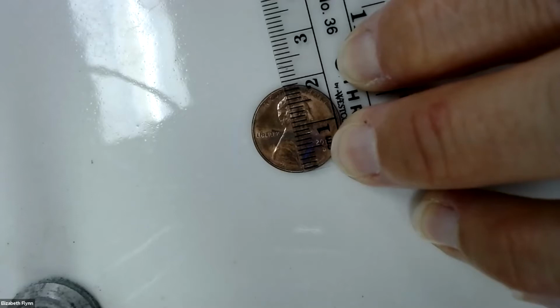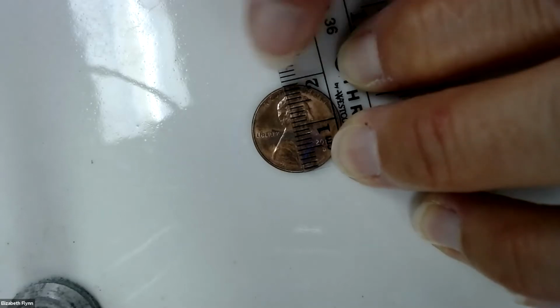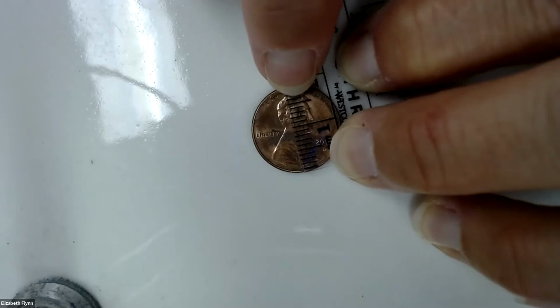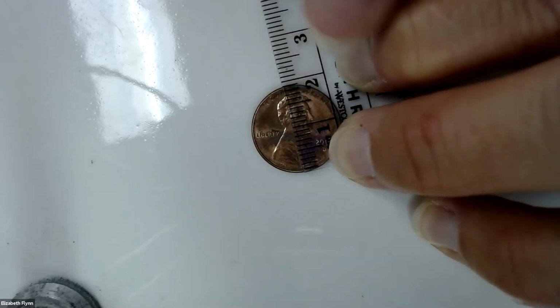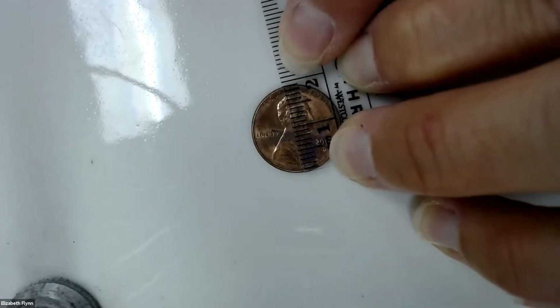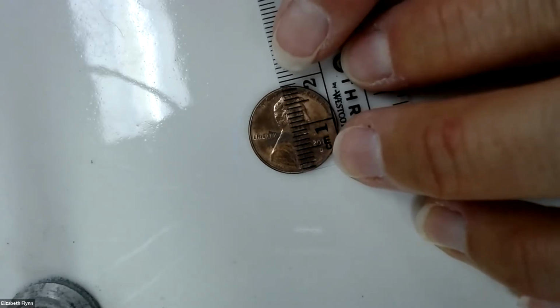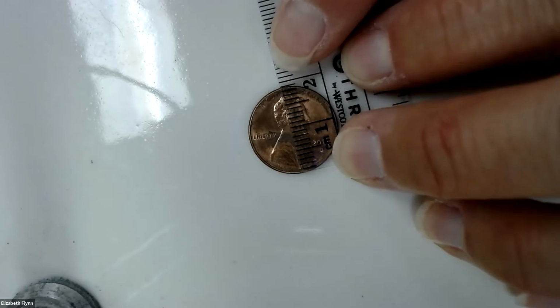We know it's at least 1 centimeter for sure, right? We know it's at least 1.1, 1.2, 1.3, 1.4, 1.5, 1.6, 1.7, 1.8. And to me, when I line up the very end of the ruler with the edge of the penny, that hits just before the 1.9. So I like to say that this diameter is 1.89 centimeters.